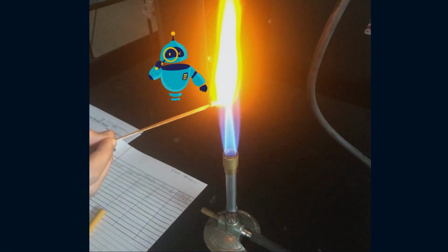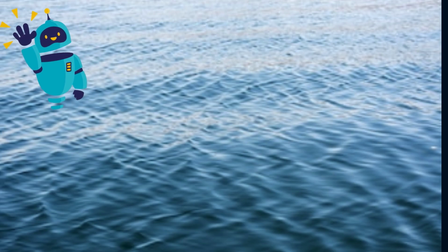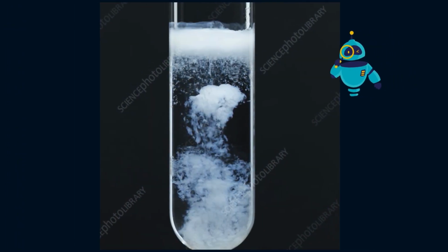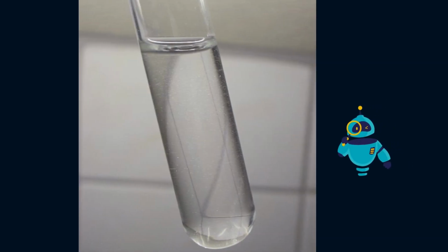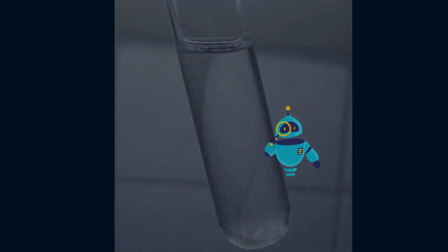Now, let's talk about water, a source of life. Cadmium salts exhibit specific solubility characteristics. For instance, cadmium carbonate is sparingly soluble in water but dissolves in acids. Observing the solubility behavior of a substance in various reagents can help in identifying cadmium.